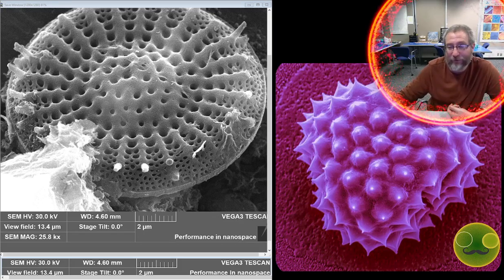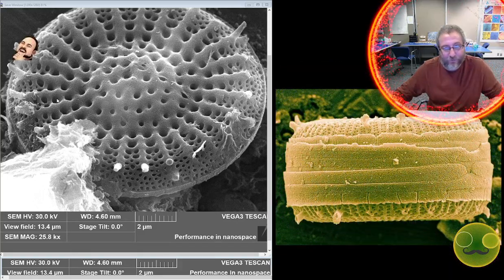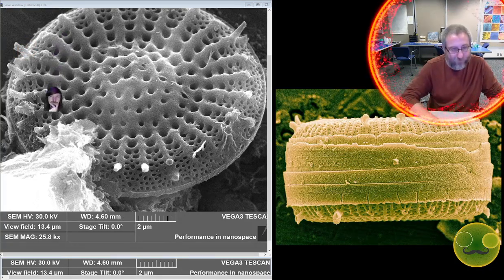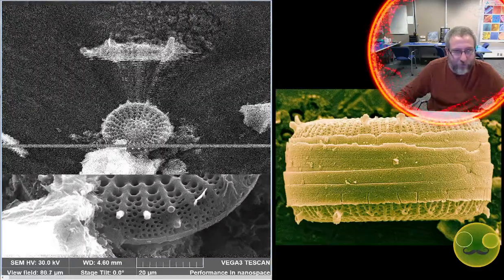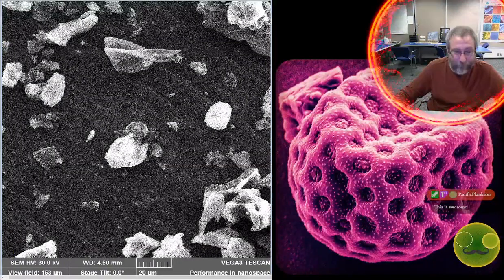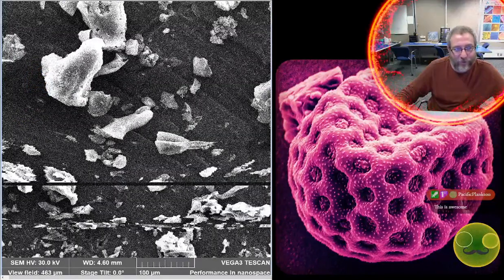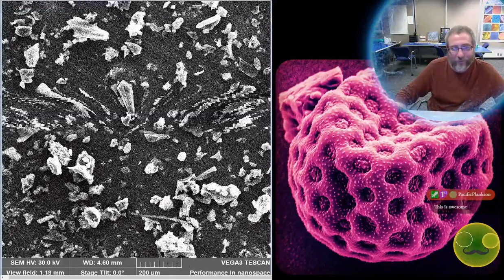A bit earlier, we were looking at some diatoms that had been collected from living cells and grown in cultures, so this is not that. This is the other part. And we get to look at all these cool diatoms. And we were talking about diatomaceous earth a little bit and what you could use diatomite for. So when you have 10 million year old diatoms and they are most of what's present in whatever you're looking at, usually we call that diatomite.